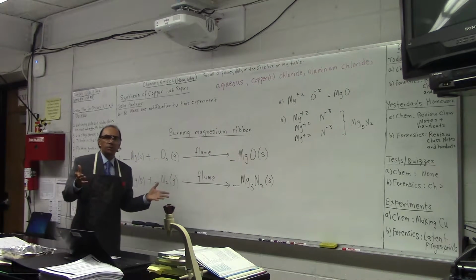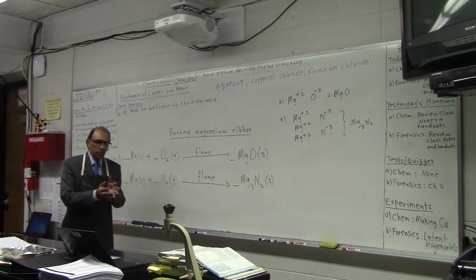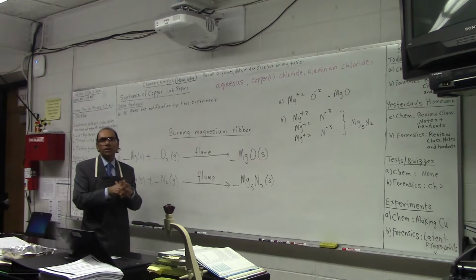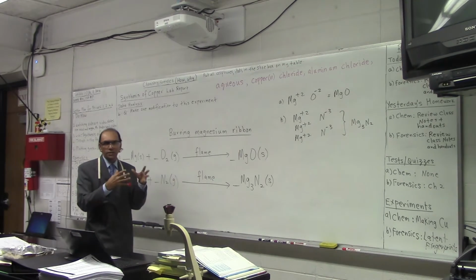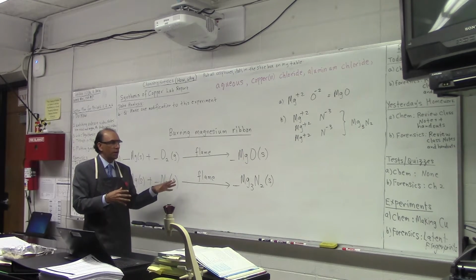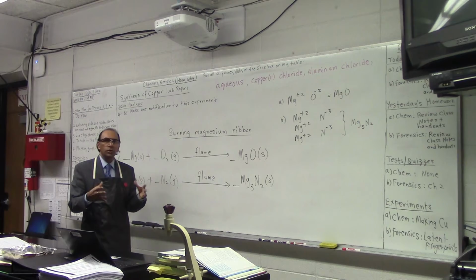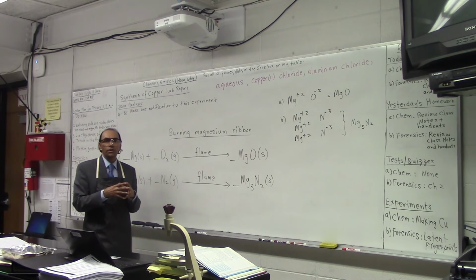All right, so this is a simple experiment. What I do in class, preparing, discussing all of this, probably takes about 2 periods, carrying out the experiment and having a long discussion and data analysis on what we've done in class. So it's a really exciting experiment. My students love the experiments. Hopefully you try it out, and hopefully you're successful.